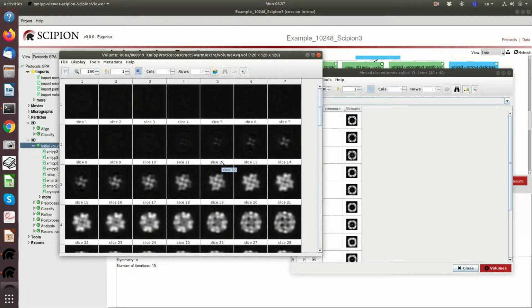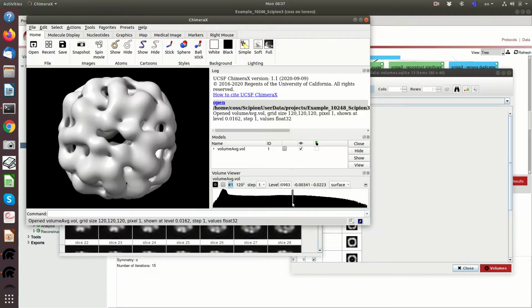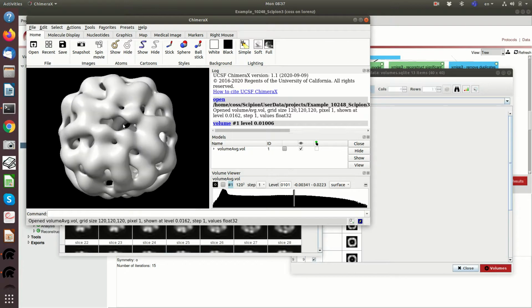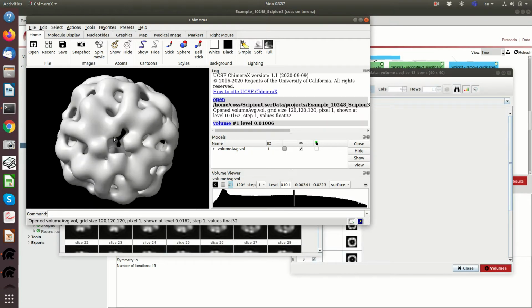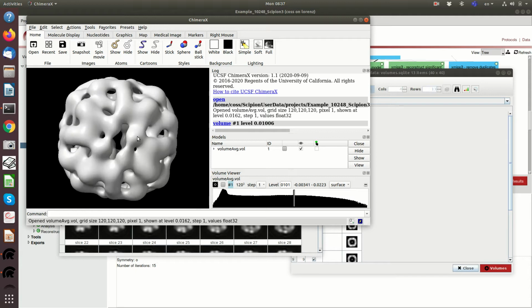You can see that it is low resolution, no doubt about that, but it has the right shape. It has these four corners that we know our structure has. But these four corners have been automatically chosen among all the possibilities.